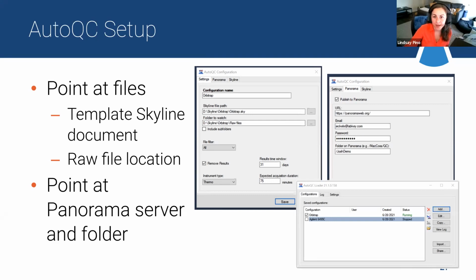Kind of a technical question. Do you need admin rights to change or create a guide set, or can any user do that? So it is all permission based. I believe that to create a guide set, you just need to be an editor in that folder.